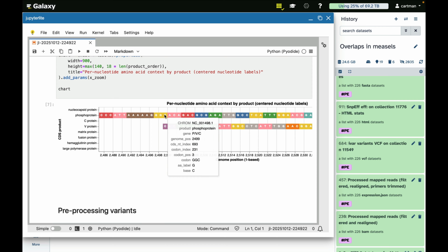But once the virus is in the cell, in some fraction of RNAs, you have an insertion of an additional G in here. So essentially what's happening is that this codon is extended, and so the V codons begin. You can imagine GG, and there's an additional G inserted here, and therefore everything shifts by one. So from this point, the V protein becomes different.